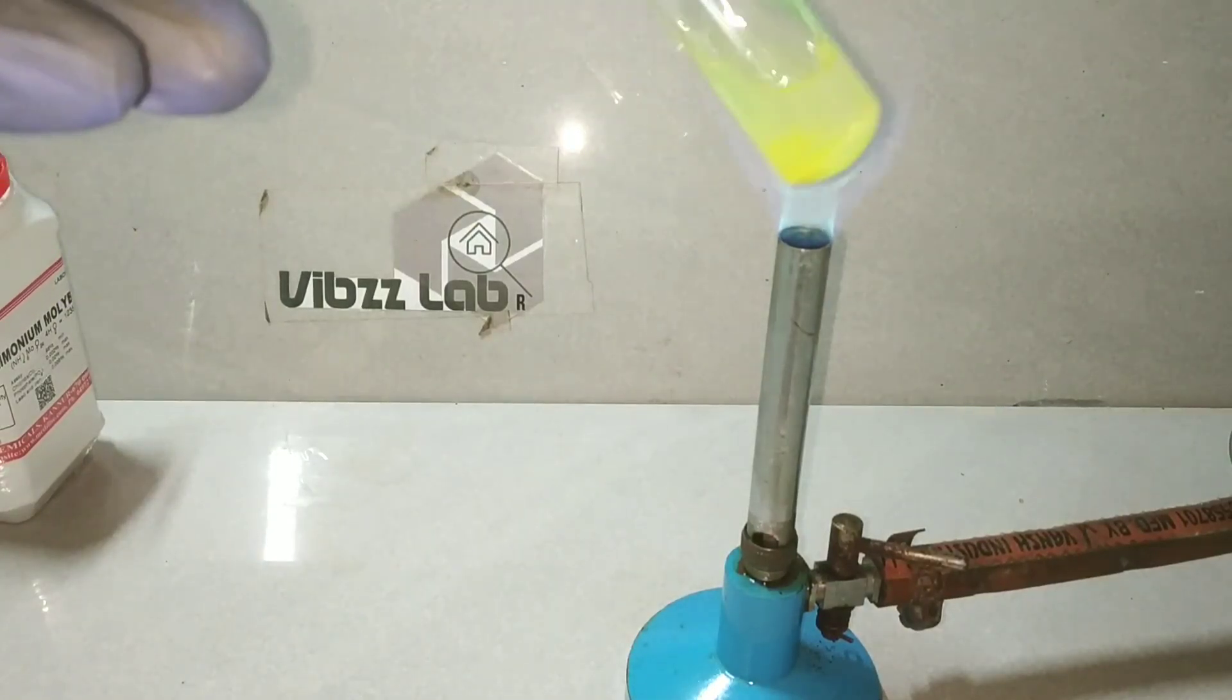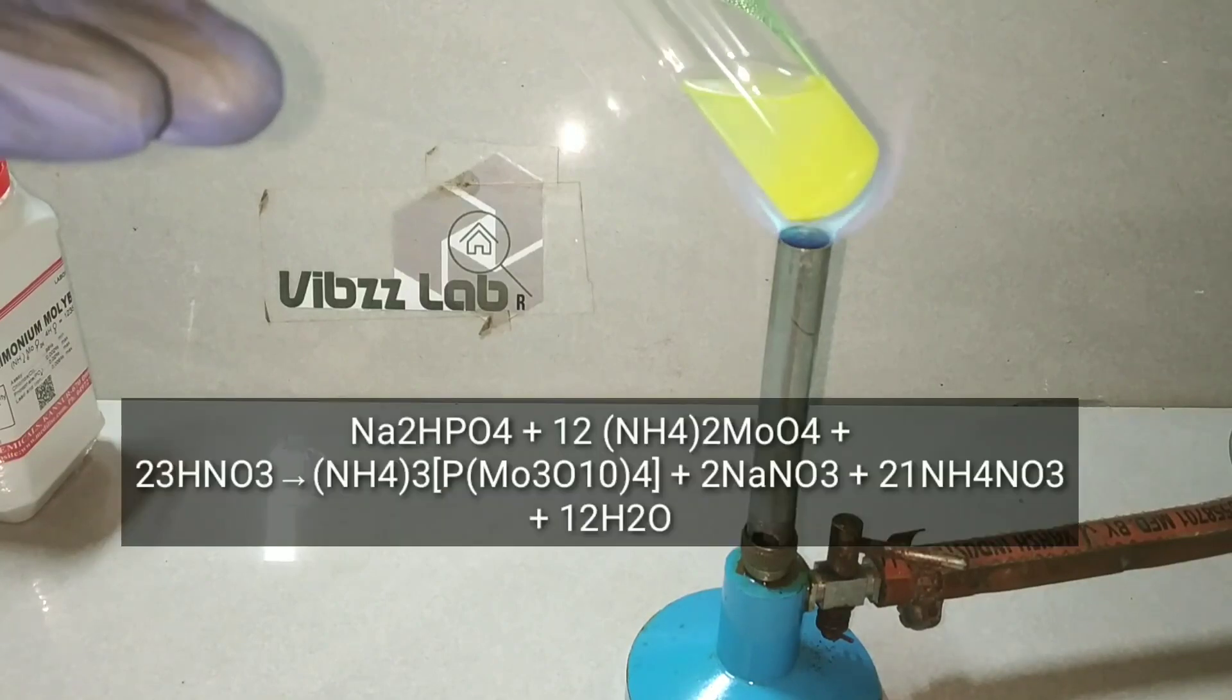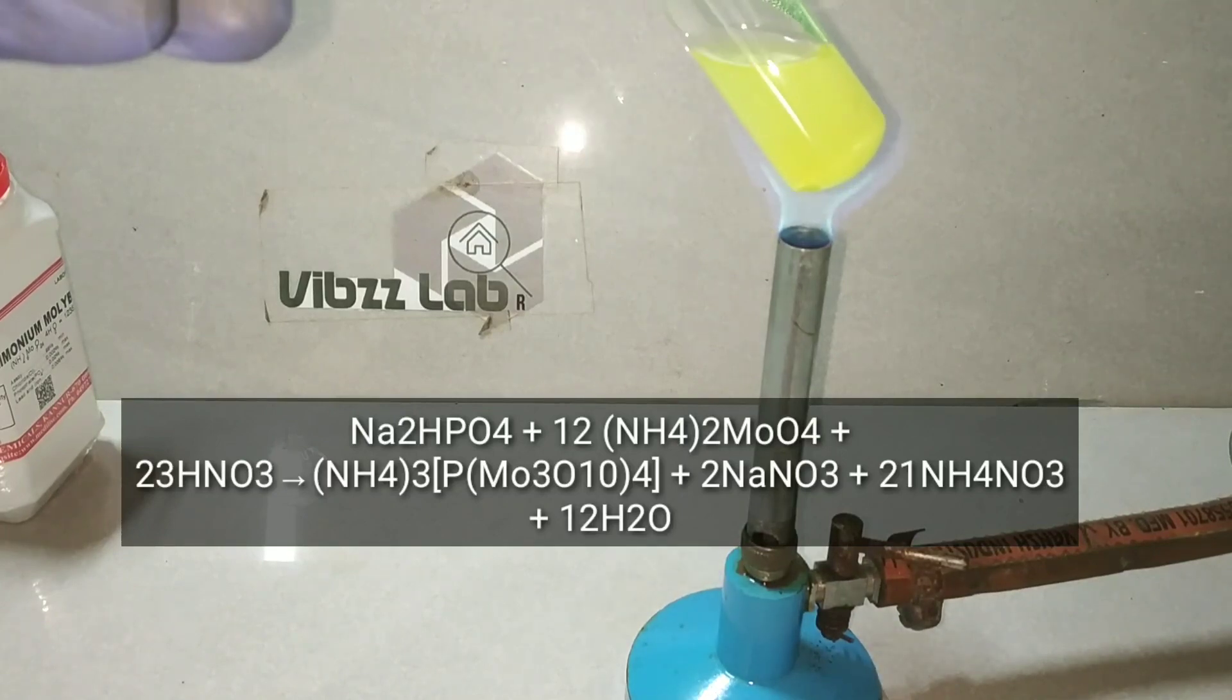What is happening here is that ammonium molybdate reacts with disodium hydrogen phosphate in the presence of nitric acid, forming ammonium phosphomolybdate, which has the canary yellow color to it.